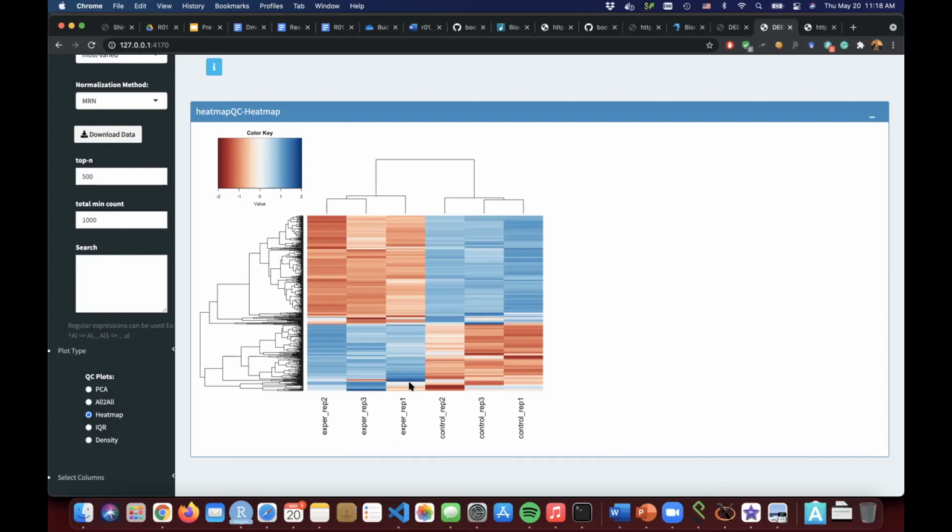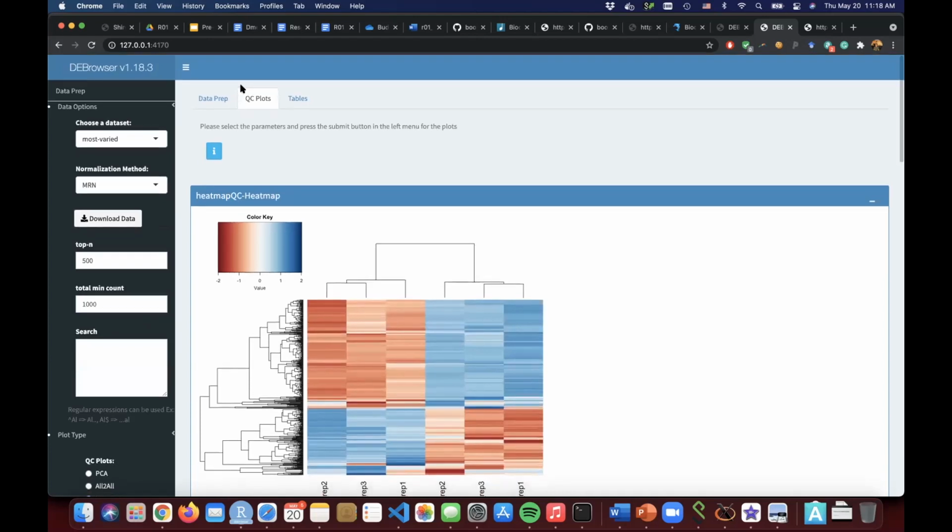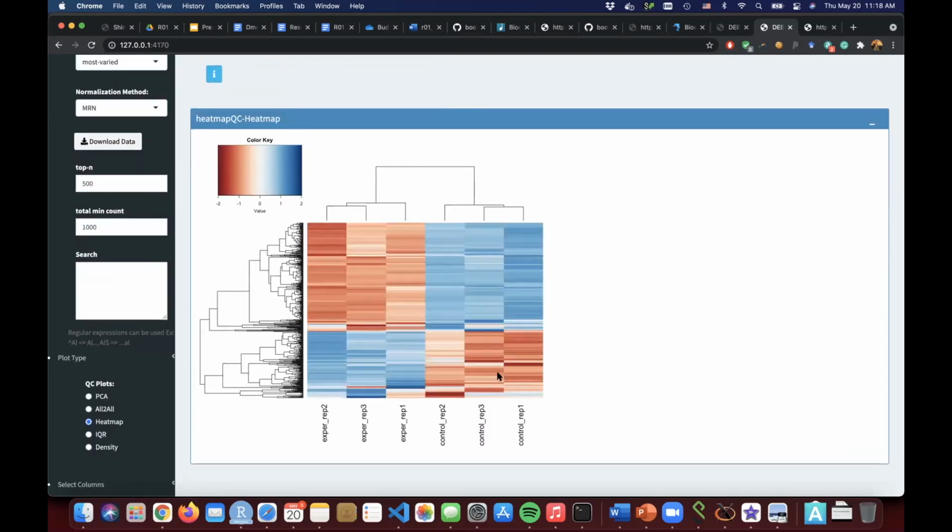Sometimes there's a huge fold change for these genes between this and that when you look only at the average, but this is not repeatable in all the experiments you perform, all the treatments you perform, so you should remove them. So differential expression analysis is doing that. So this is the QC that you're applying.